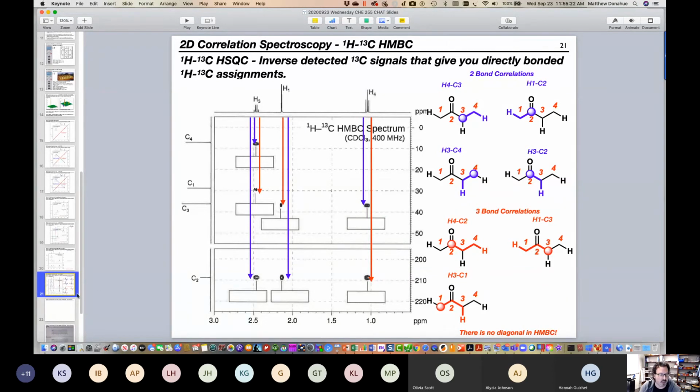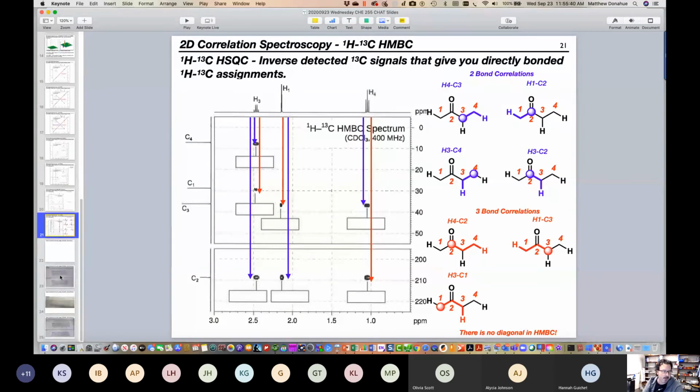So this sort of spectroscopy is used for increasingly complex molecules that can't really be solved with proton or carbon data. And so I thought I'd share that with you because it is nice. If you like to solve puzzles, that type of data is really neat to analyze.